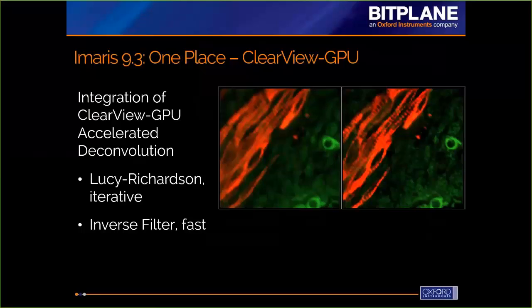And if you want it to be even faster, there is an inverse filter method. It's called the FAST method inside the software, and that is available, but it's not as obviously as sophisticated as using the Lucy Richardson method or the iterative method.